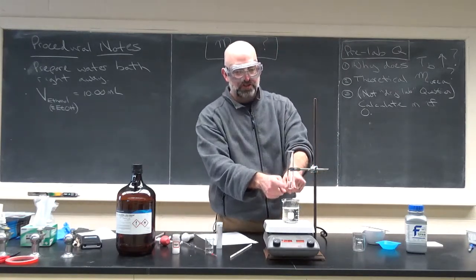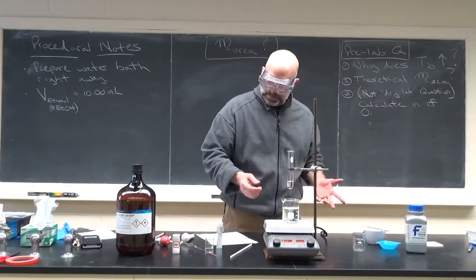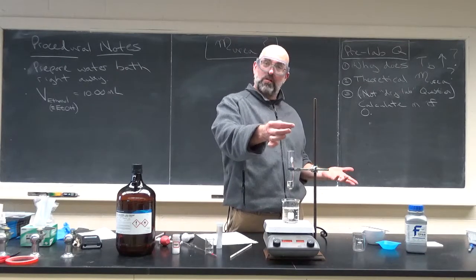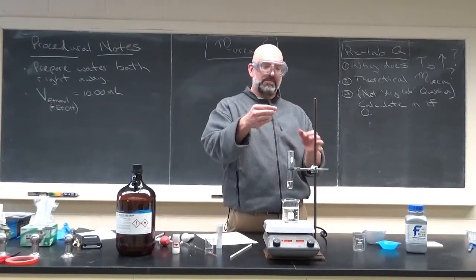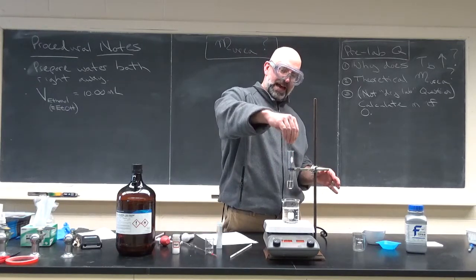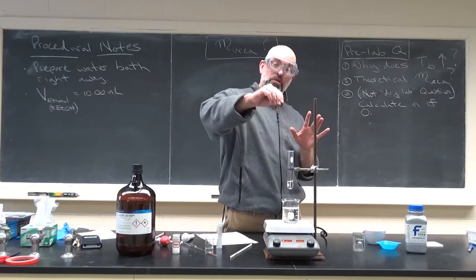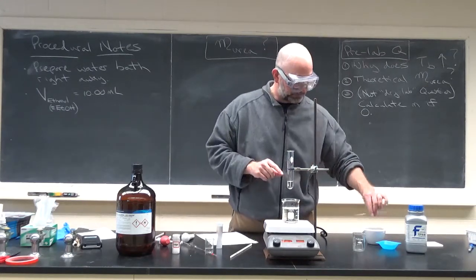The point is, all this urea has to be dissolved. And like I said, it will dissolve even if you need to get a stirring rod and put it in here. It's not typically what we do, but sometimes if the spatula is clean, you can reach it down, almost use like a paddle wheel. I wouldn't recommend this. Just make sure you don't break the capillary. Be careful. We're only doing one trial with each.